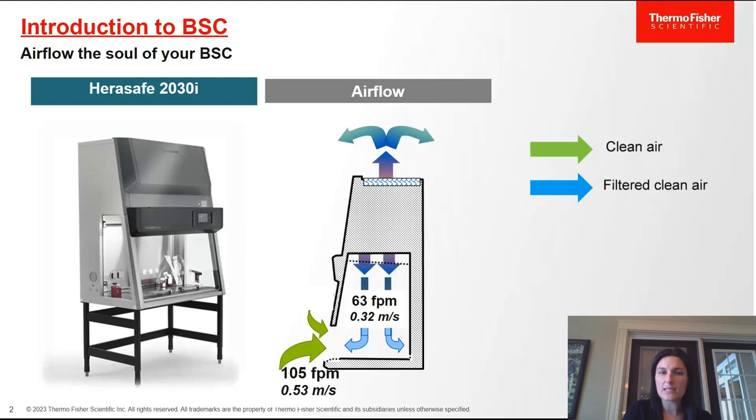The inflow velocity per NSF is 105 feet per minute. If the inflow were to get too high, this could risk sample integrity as air could reach the work surface and affect your samples. The downflow velocity per NSF is 63 feet per minute, and if that were too high, air could escape out of the front opening, impacting the individual working within the biosafety cabinet. This is why it's important to maintain balance at the front barrier.